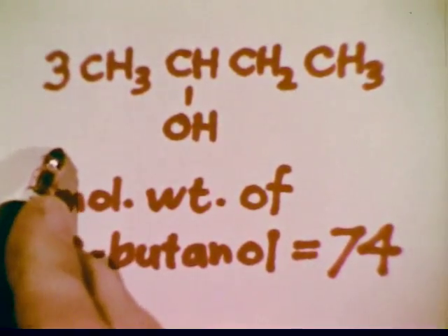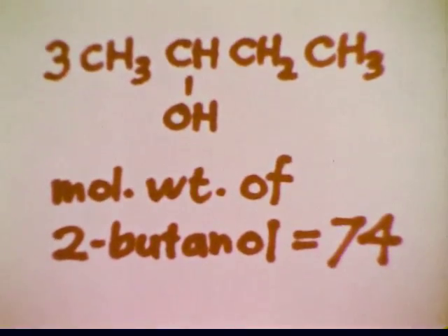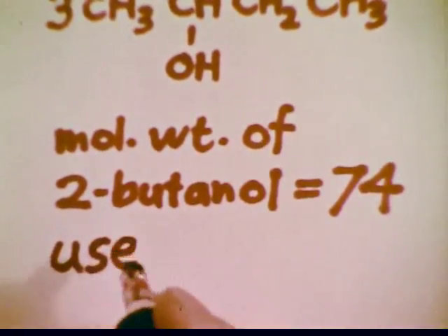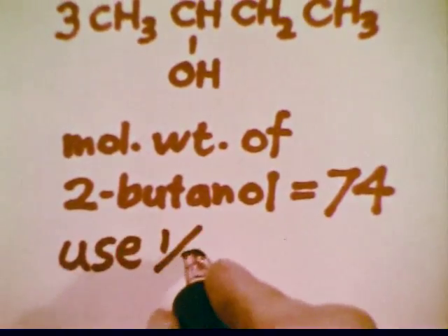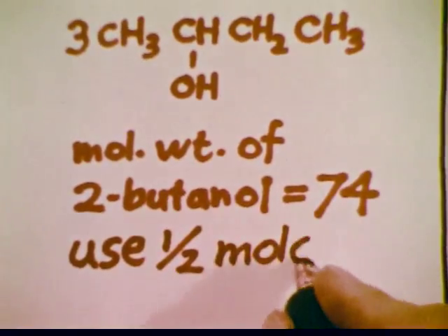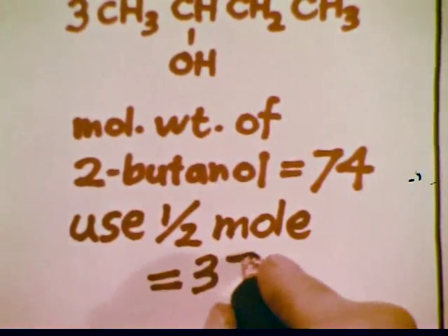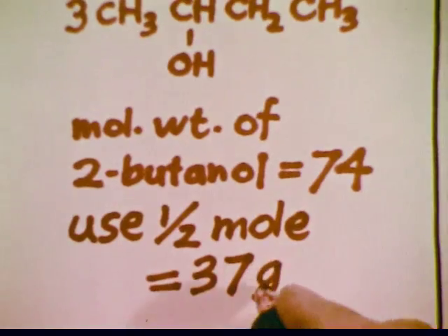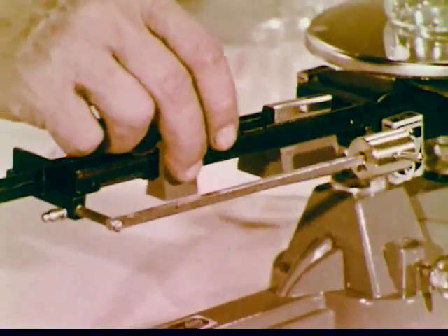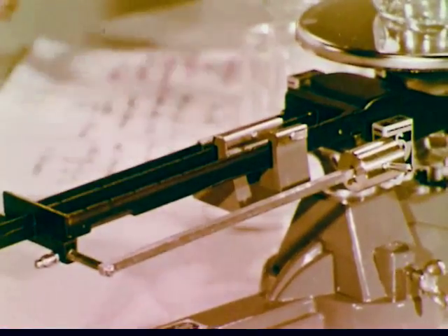2-butanol has a molecular weight of 74. For the size of the apparatus we shall be using, one half mole of butanol will be a convenient amount. One half mole will be half of 74, or 37 grams. First, the empty beaker is weighed and the balance set for the 37 grams determined by the calculation.